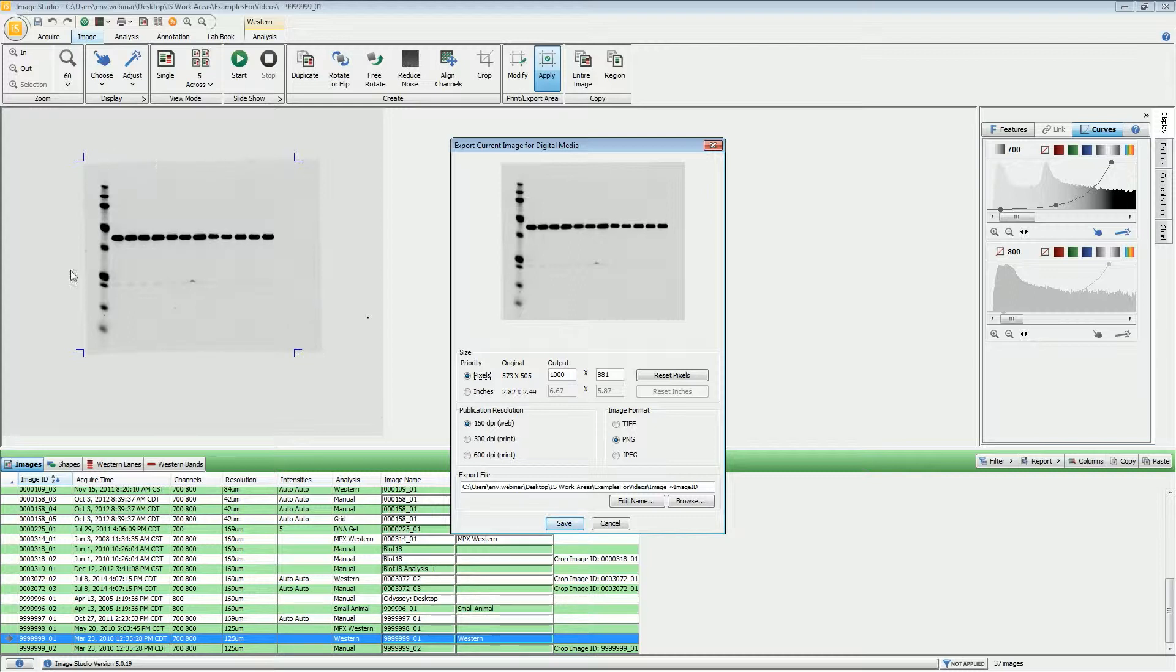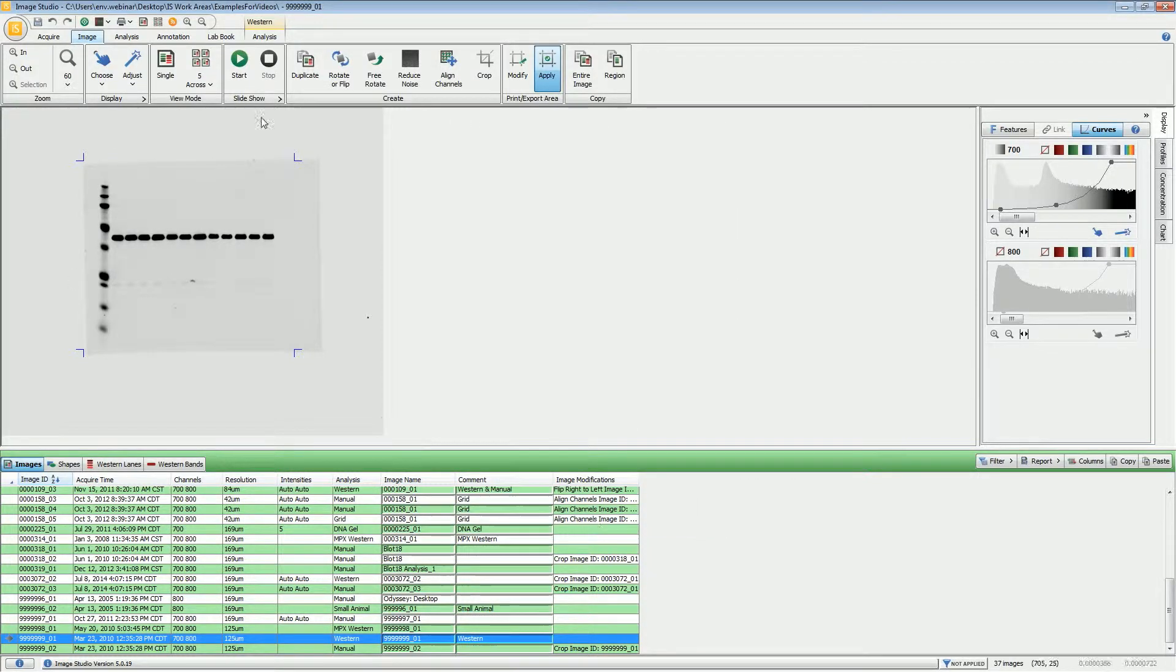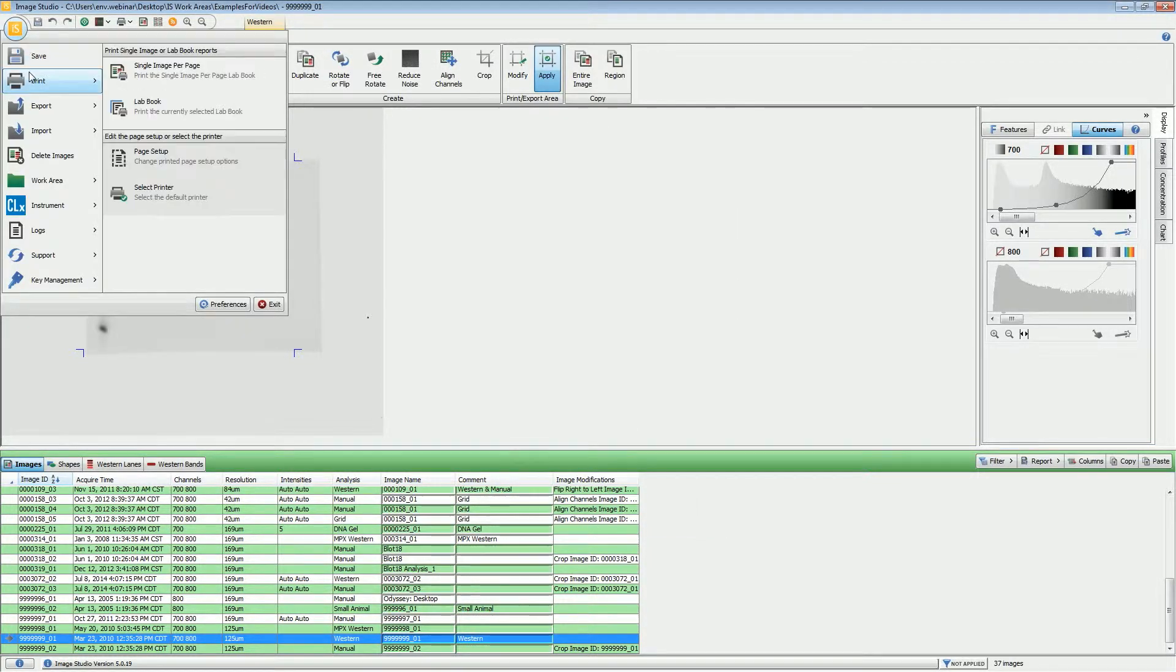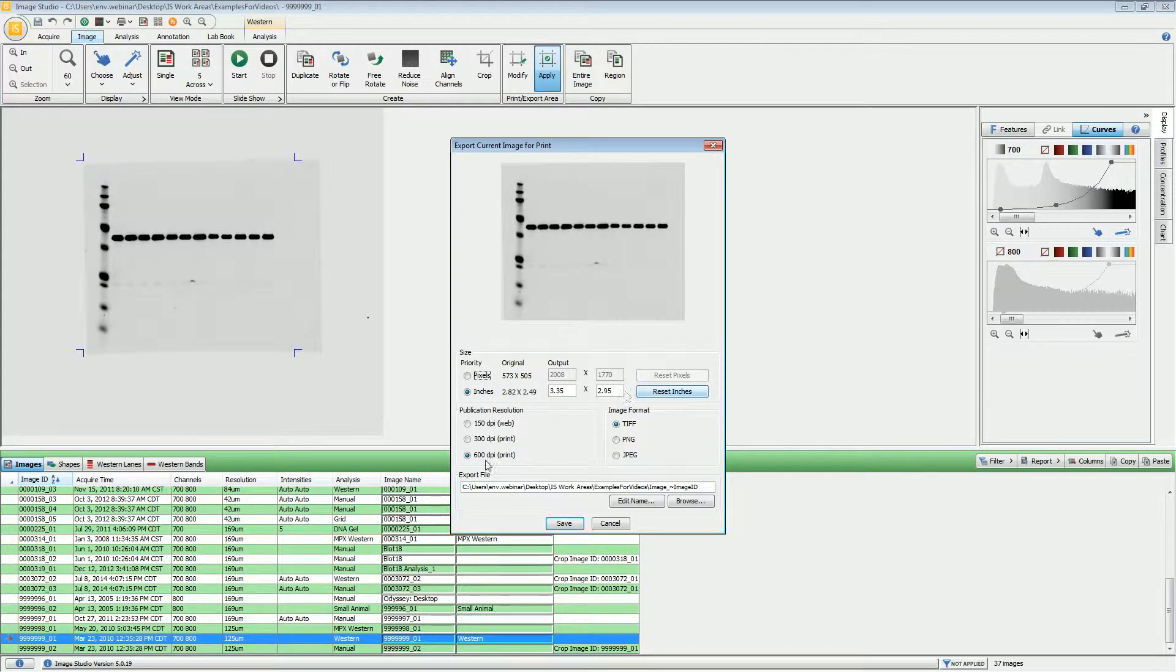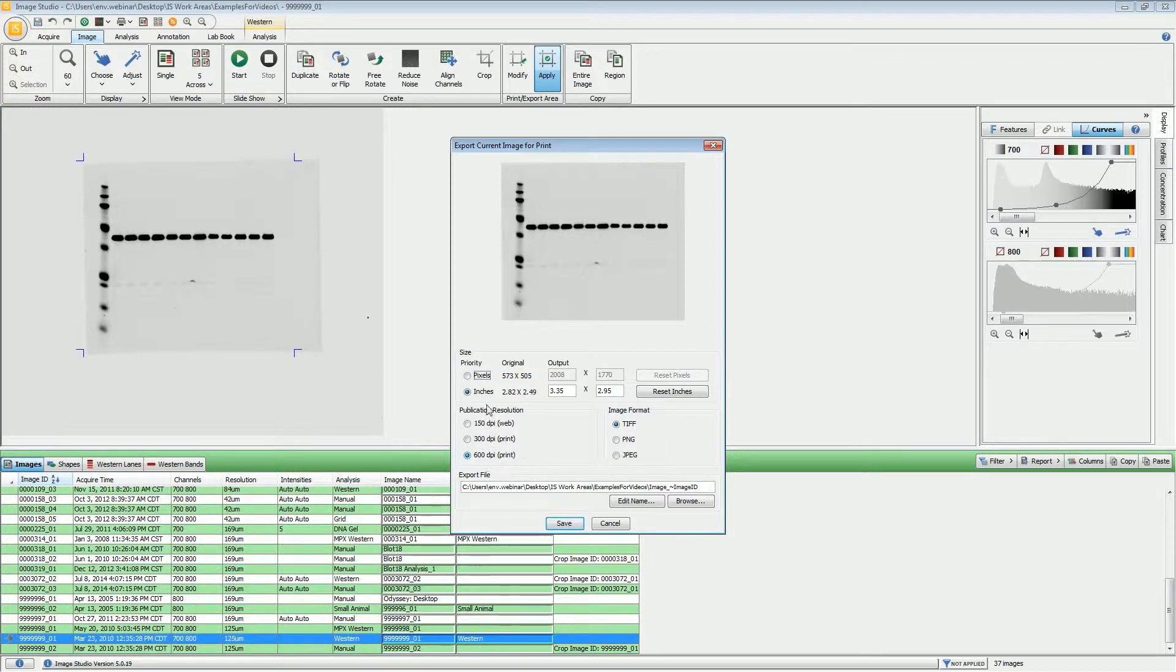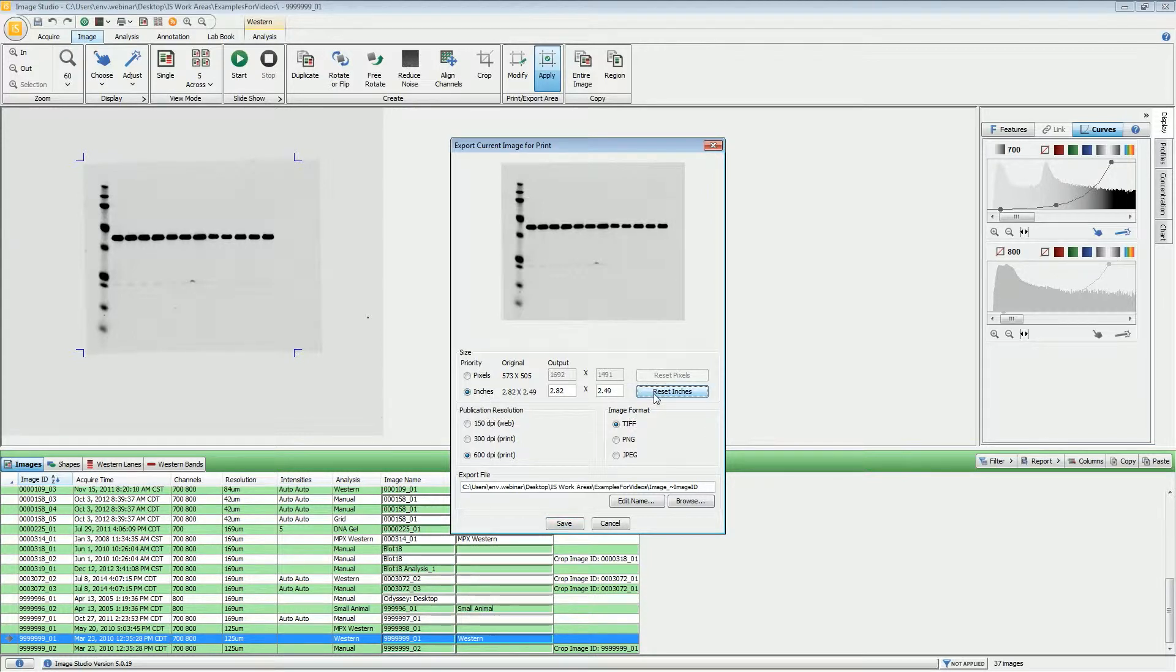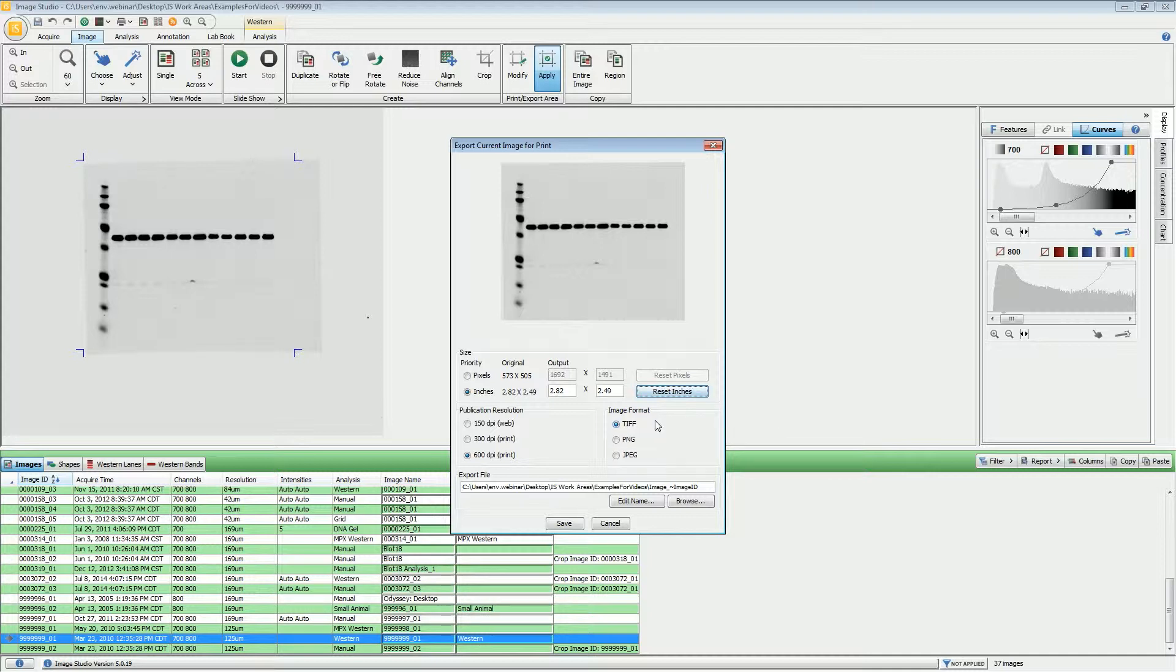For Images for Prints, that changes the default settings to either 600 or 300 DPI and then the number of inches. Again, you'll want to reset that to the original number of inches. The default is that it is a TIFF file, which is most appropriate for publication within journals or if you are trying to print something. Again, we have the same options for the naming convention and choosing where the file is saved using the Browse button.